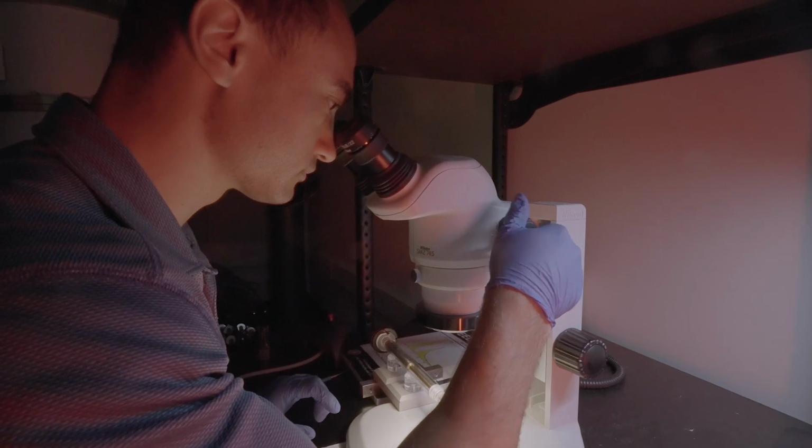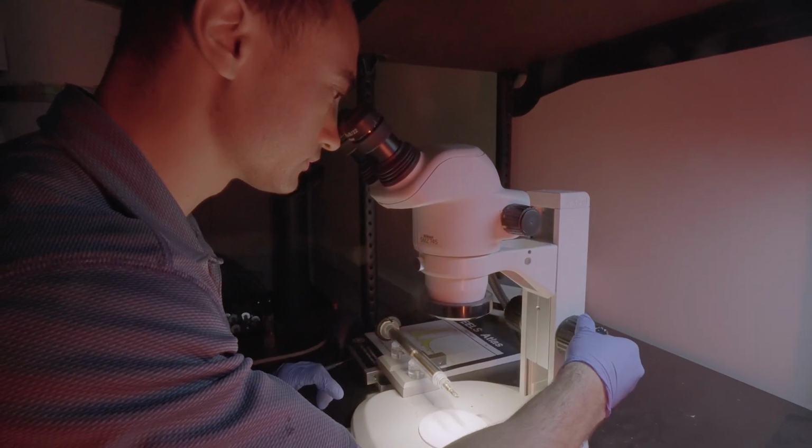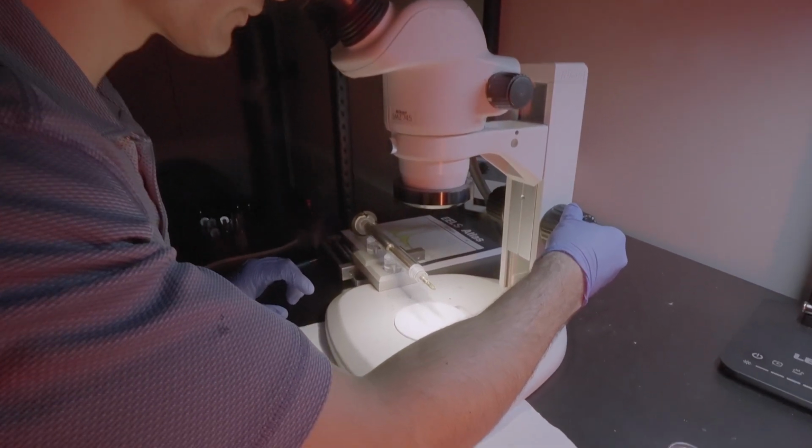My research is in developing new computational methods to visualize the 3-dimensional structure of nanomaterials, specifically using electron microscopes that can use very fine electron probes to visualize the atomic structure of materials and correlate these 2-dimensional images with 3D visualizations of its whole entire morphology.